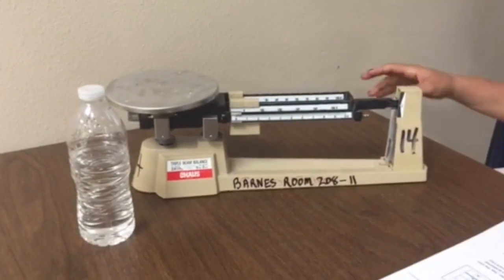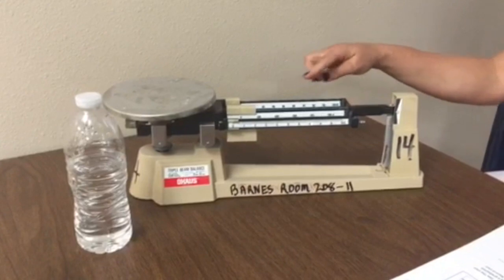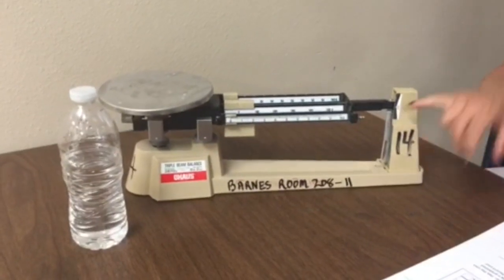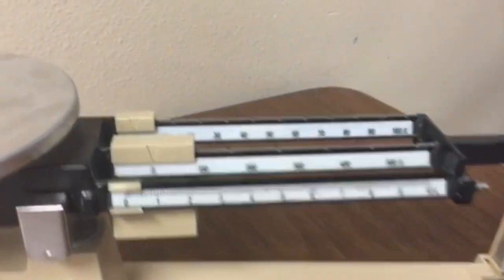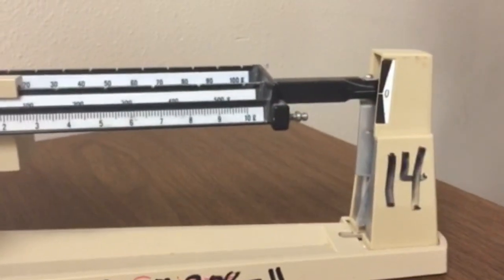Today we're going to be measuring mass using a triple beam balance. When you measure mass, you always make sure that your triple beam balance is starting at zero. Make sure your measurements are at zero and your line here is balanced.